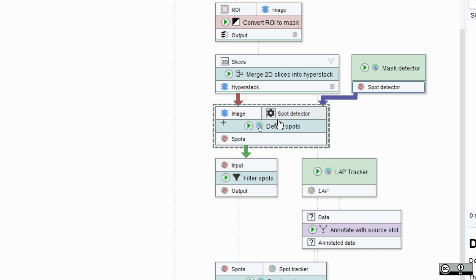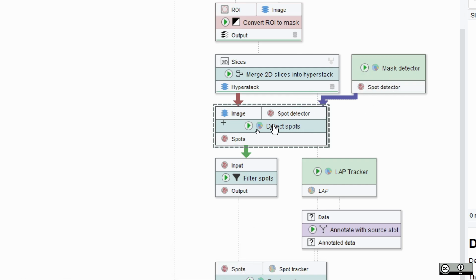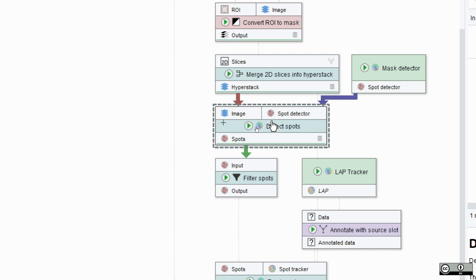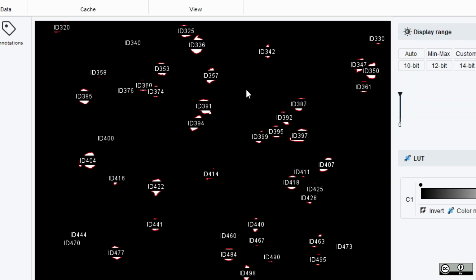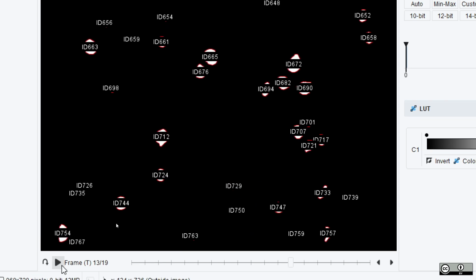And we say we are looking to identify spots which we can track in time, and these spots should come based on a mask. So what I say is I need to detect masks, and then I need the image on which to detect them. And when you run this one, it will identify the neutrophils based on the binary image, the threshold image, as objects which can be tracked over time. So if I run this one, these are the identified and tracked neutrophils.